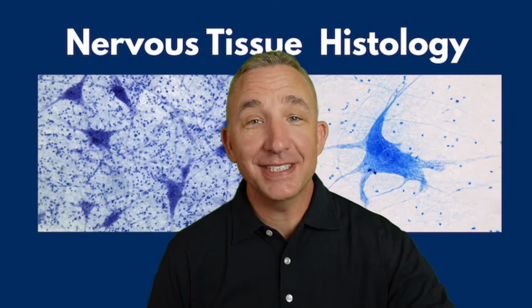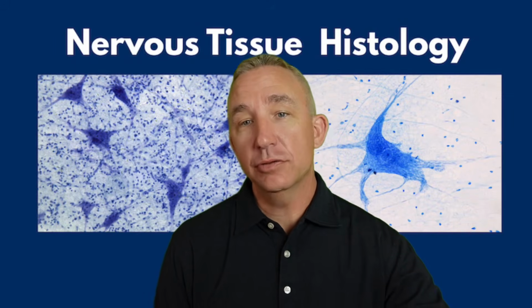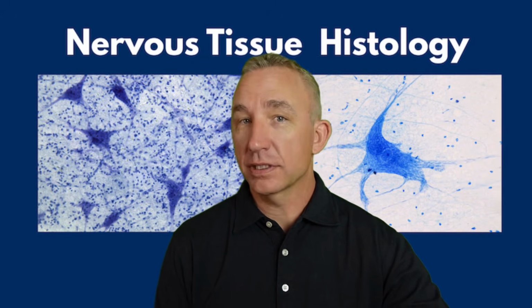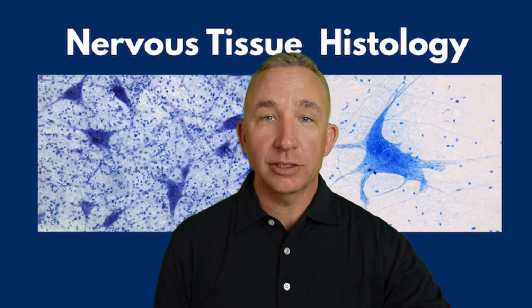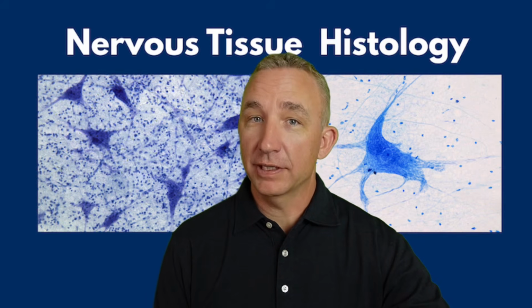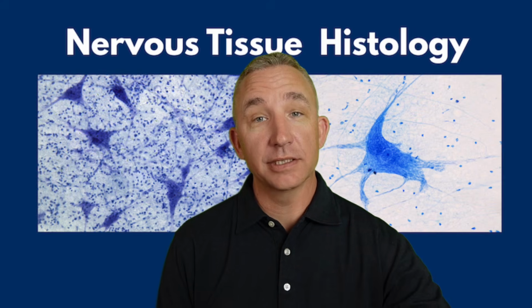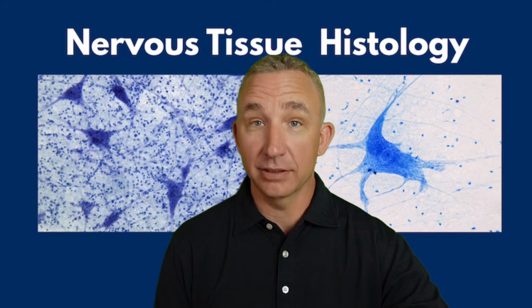Let's cover some nervous system histology. I have two slides to show you. This first picture, we're going to look at nervous tissue focusing on neurons. And then the next one, we'll look at a nerve. Remember, the definition of a nerve is that it's a bundle of axons. So when we look at it, you'll see that's very similar to how we organize a skeletal muscle.